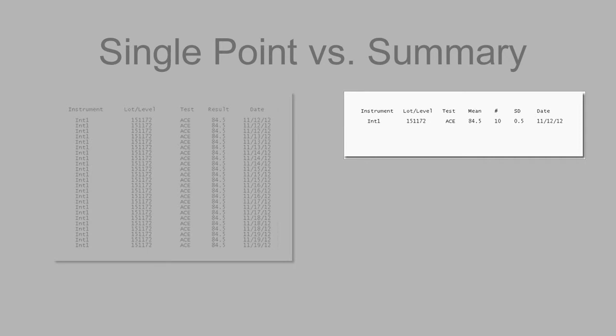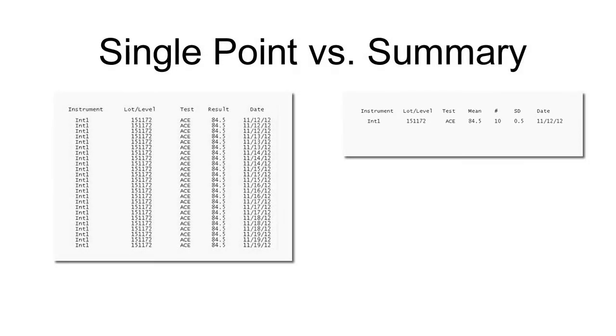Summary data will not be evaluated against any rules, nor displayed on Levy-Jennings charts. It's suggested for Unity Interlab participation only. With this in mind, let's compare the options for data entry so you can determine what works best for you.